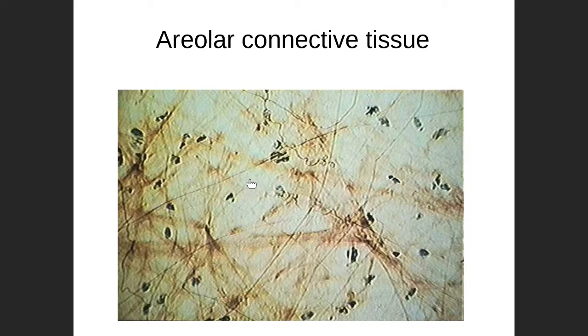Extracellular matrix is made up of ground substance, and we'll get into what ground substance is more in lecture. It's also made up of protein fibers, and we're going to talk about a few of them here. Here are these big, thick, bundle-like fibers. That's the collagen. You can see it running this way, and here's one going up and down. Any of these big, thick fibers is going to be the collagen. The smaller ones here are the elastic fibers. There's a great elastic fiber, kind of coiled up right here. Then you have a few cells scattered throughout our slide.